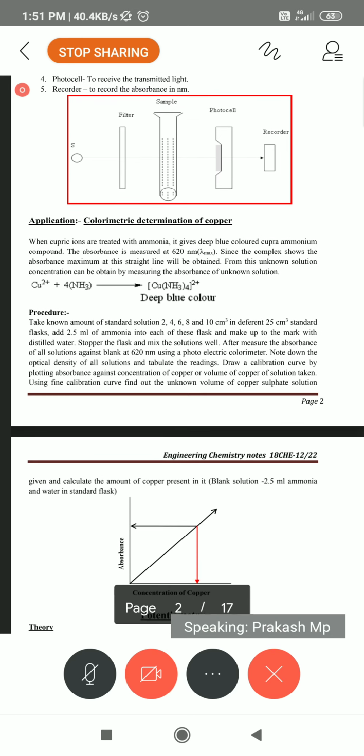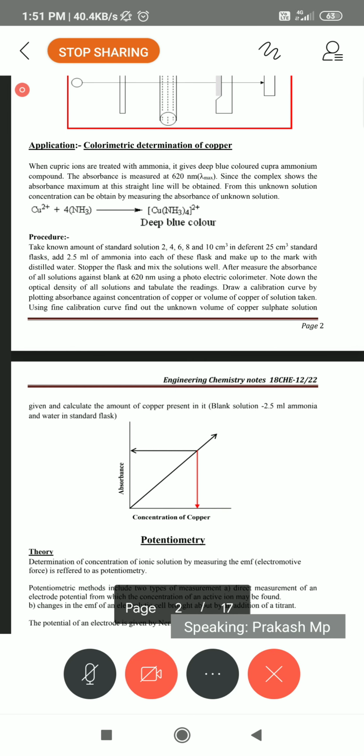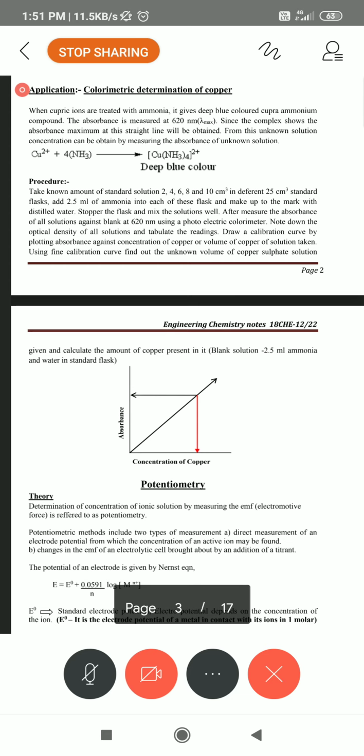So if any salt is dissolved and at that time you did not record how much of the salt is dissolved, or if you forgot to label it as a known solution, forgot to add it, or forgot to record it, don't throw the solution. Again, you will prepare one more standard solution. The unknown solution you already marked, and the known solution you can mark.